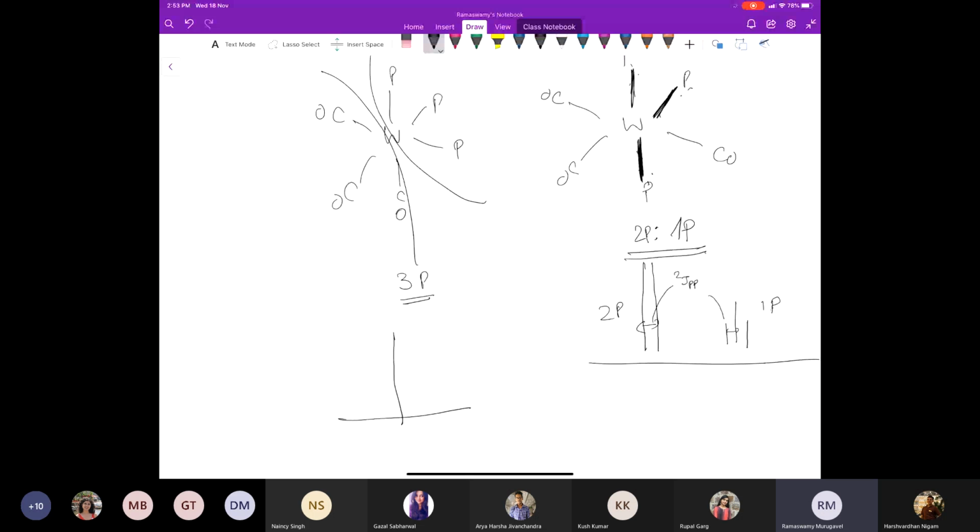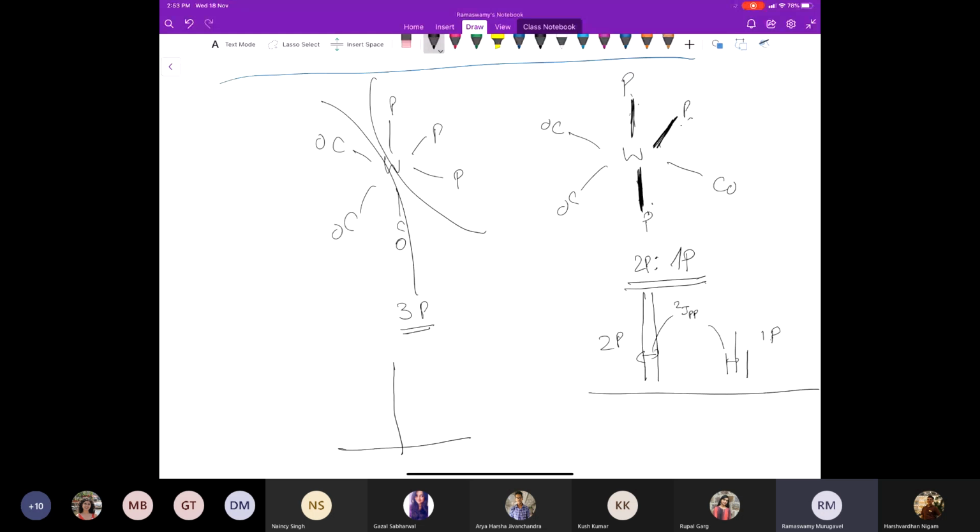However, if you want to do this, you can just do the tungsten coupling. So what will happen is that, apart from these 2 main lines with the same coupling constants, you will have the satellites here. Same way for this, you will have satellites here. Is this clear?